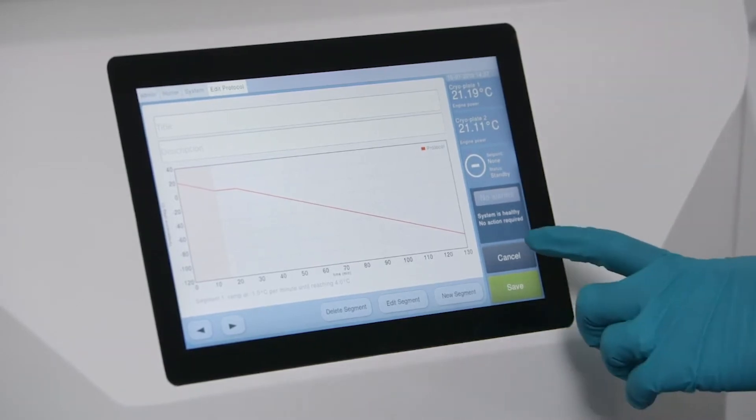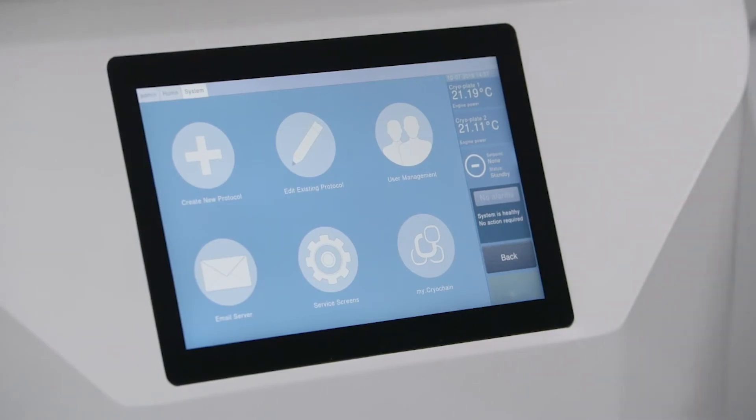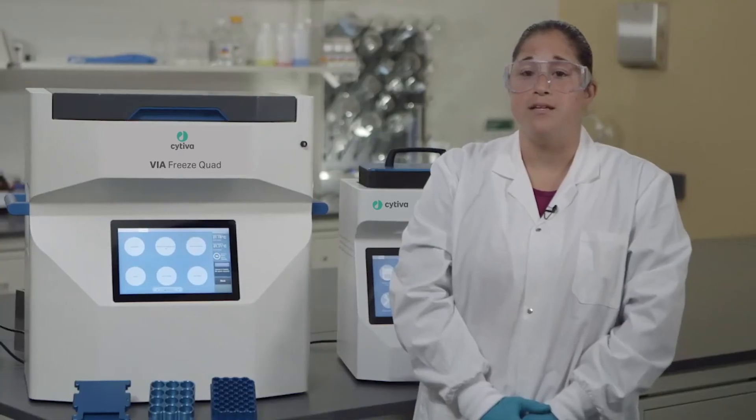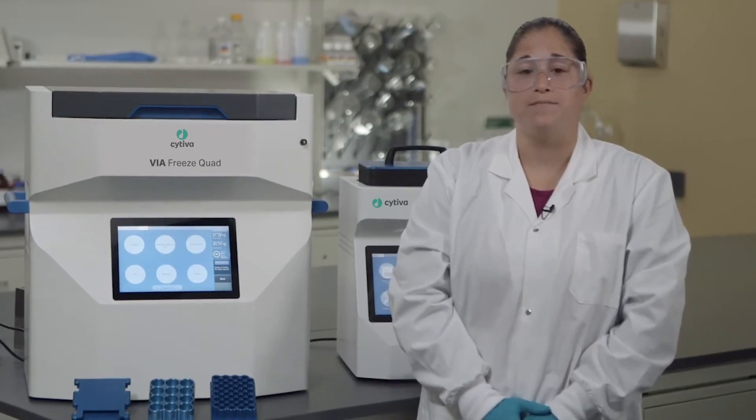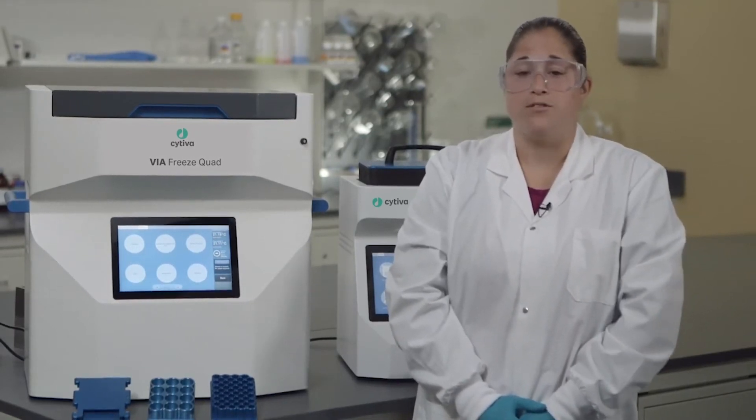We're not going to show that today because we're not creating a new protocol. From the system menu by selecting edit protocol, you can modify the protocols already created. Access each segment which can then be deleted, modified, or you can add a new one. Ensure you click save to register your changes.